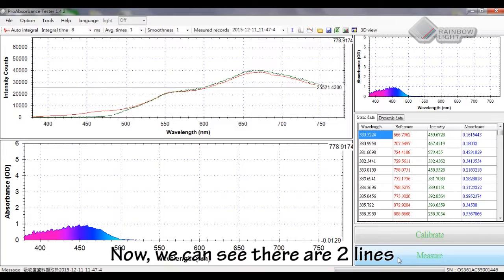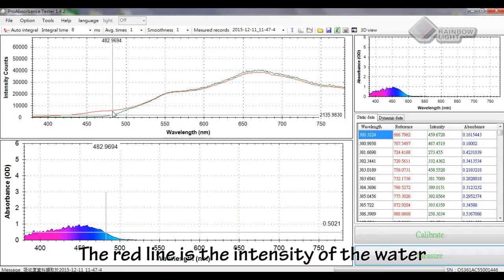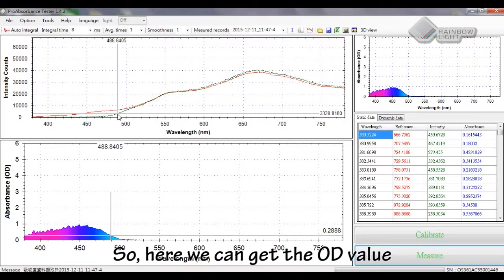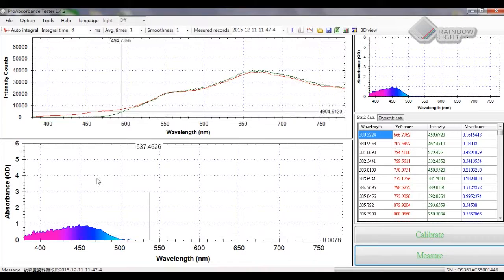Now we can see there are two lines. The red line is the intensity of the water, which is the reference. And the green line is the intensity of yellow ink. So here we can get the absorbance value and the spectrum of absorbance.